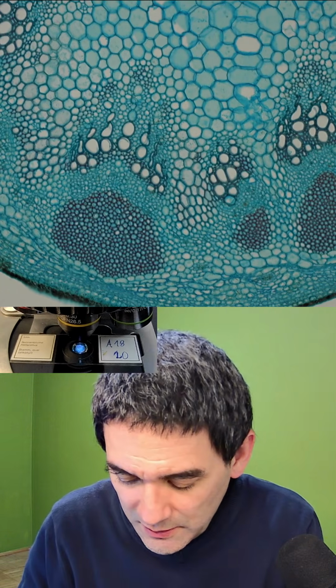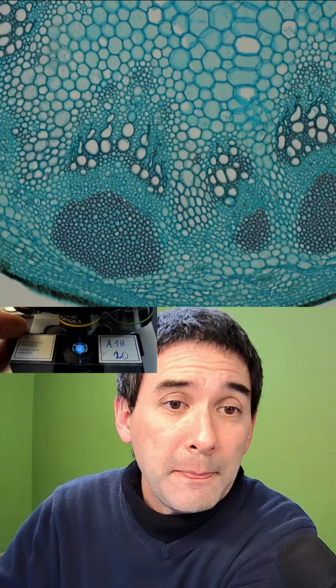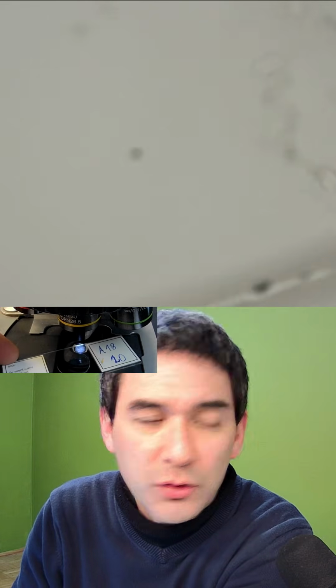Because you're talking about some old Victorian slides, you know what? I will show you those that I have. So that's the sunflower, and this one evidently is also stained. That's why I've got the blue color here as well, mixed with some of the bright pigments, the green ones. That's interesting.